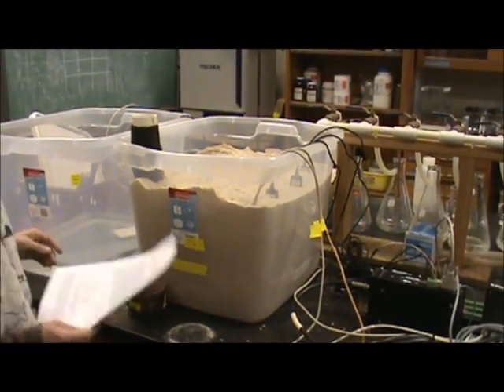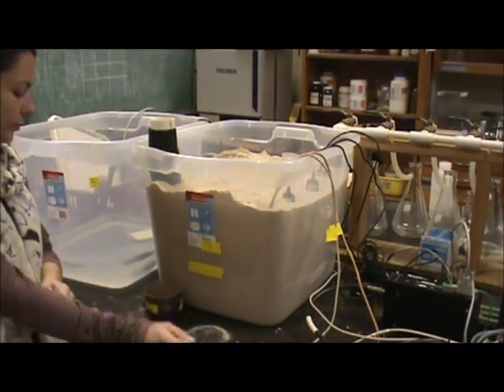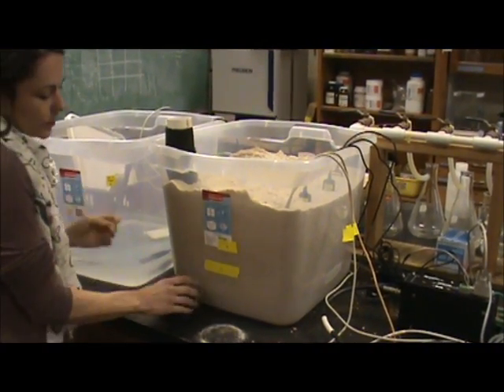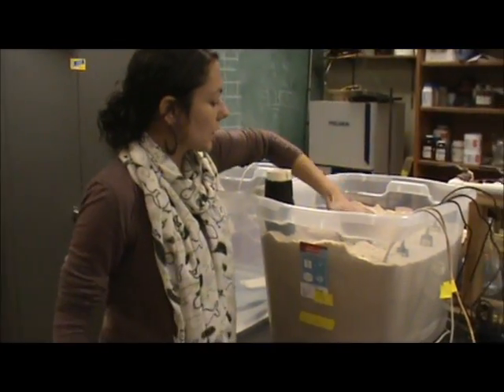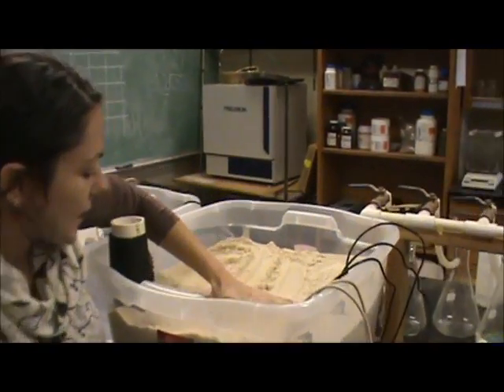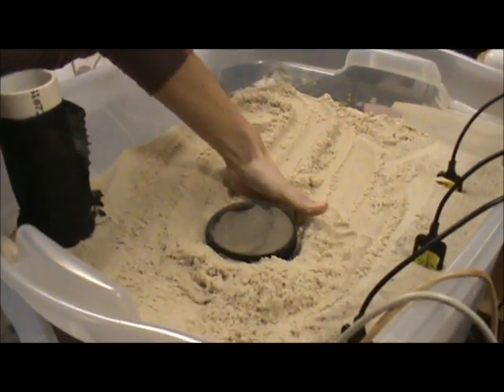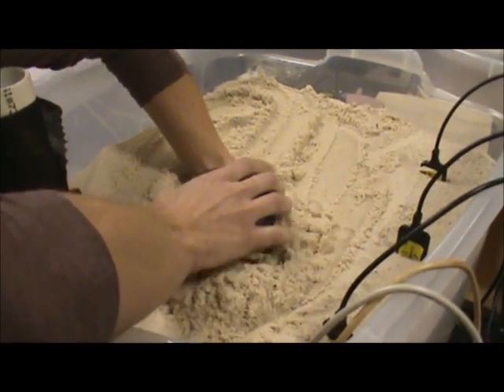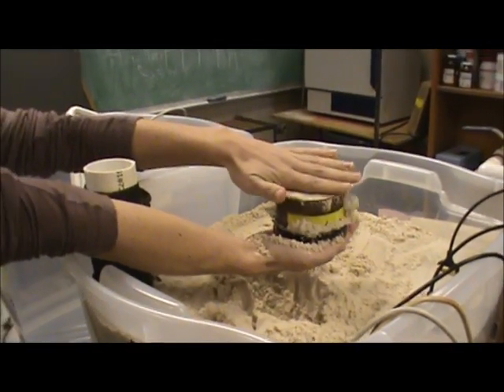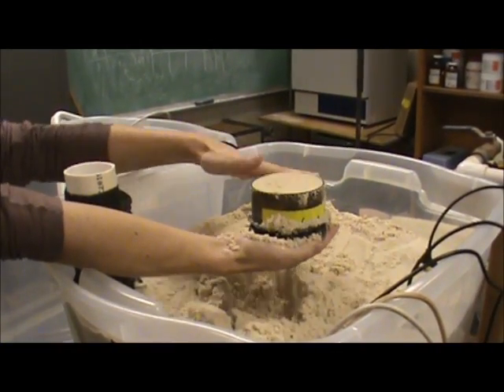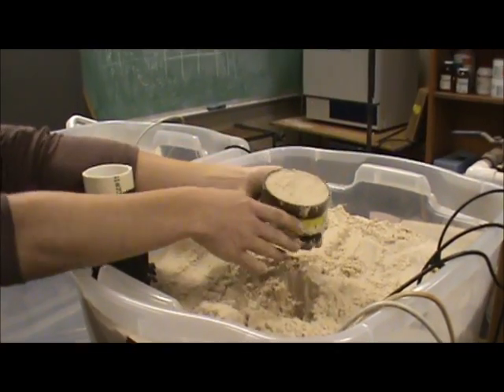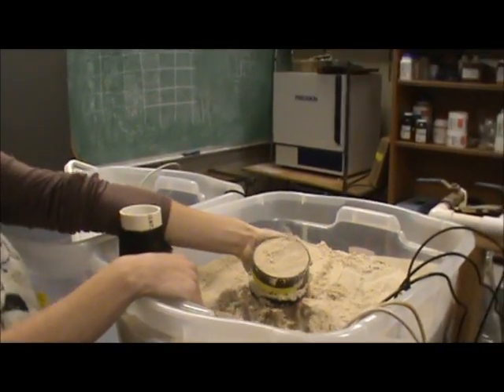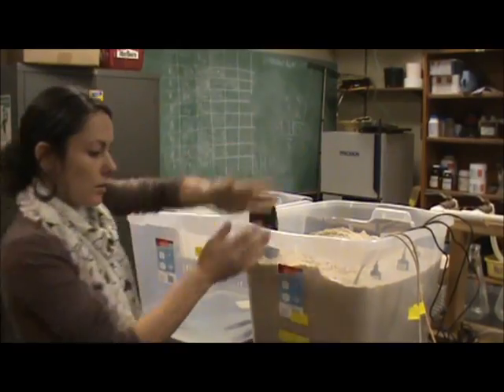We're also going to take a direct measurement of the soil moisture just by using a ring. We're just going to punch it into the sand, pull our sand sample out, flatten it off, and we'll pour this into a can, put it in the oven overnight, and we'll calculate the volumetric water content like we did in the last one.